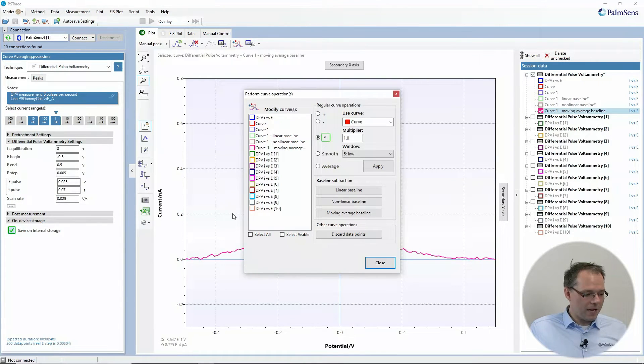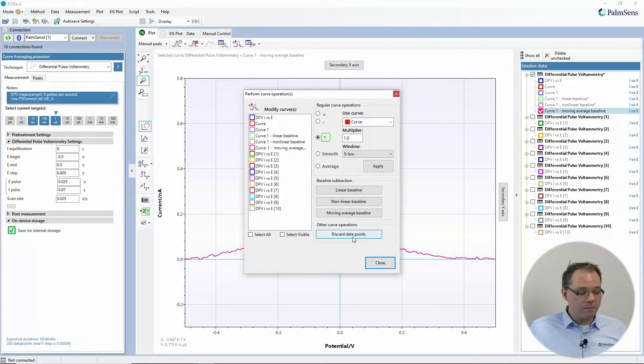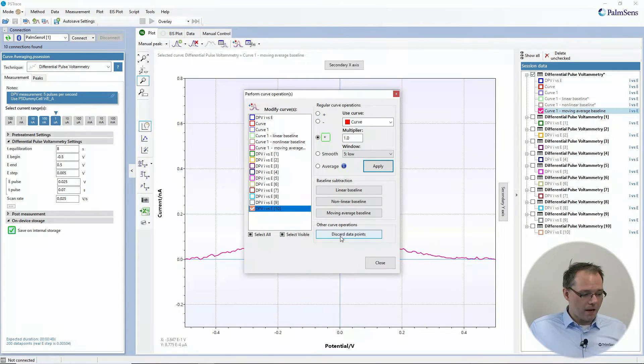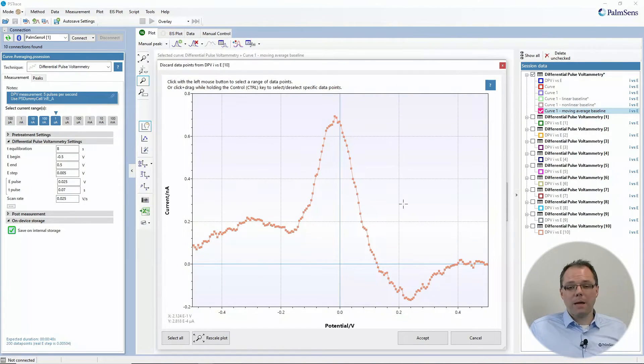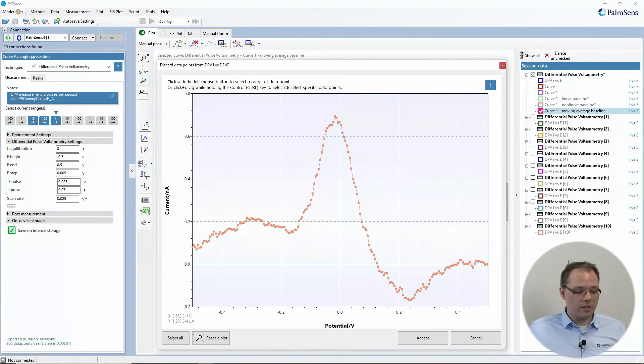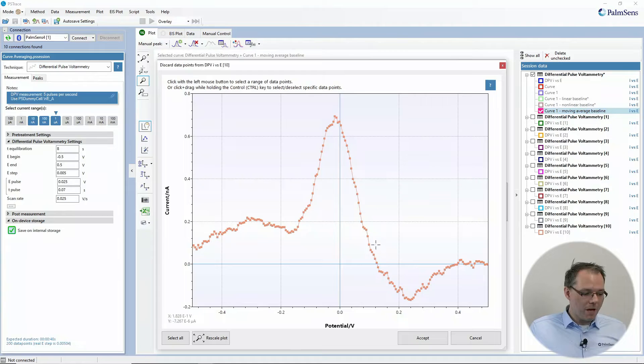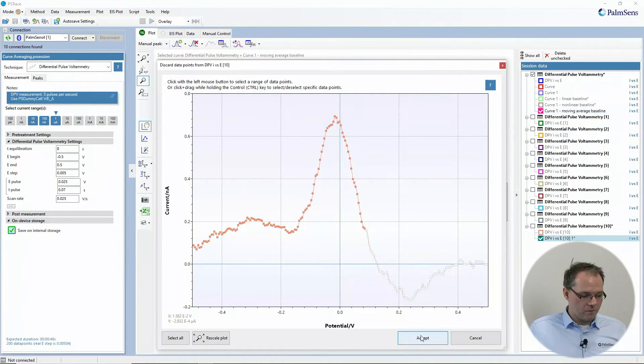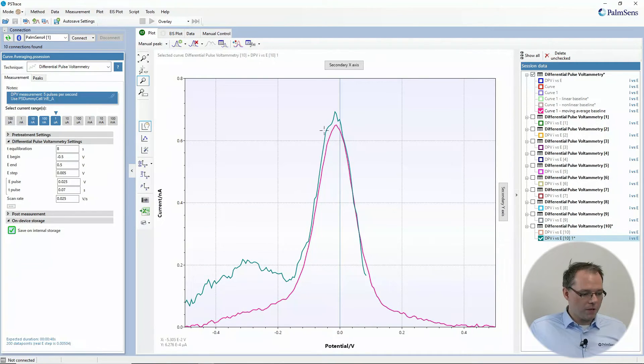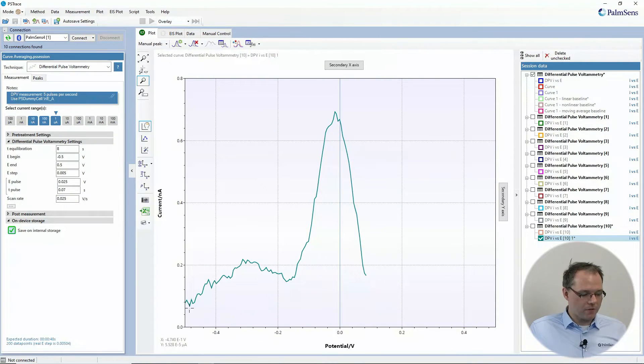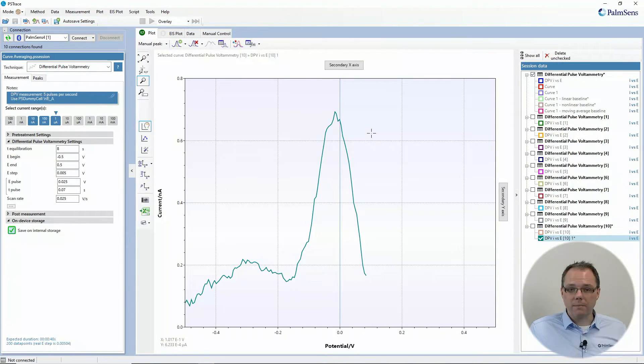Now, the last thing that we have in the operations window is discarding data points. So let's say you have a measurement and you find that parts of these measurements are obviously nonsense. Maybe someone walked by your experiment, somebody bumped into the table and you got a lot of spikes that are actually not logical. Then you can choose a part of your measurement and just cut the points off there. We accept. And then you see now we got a new curve. Now we got a new curve where a part of the points has been eliminated.